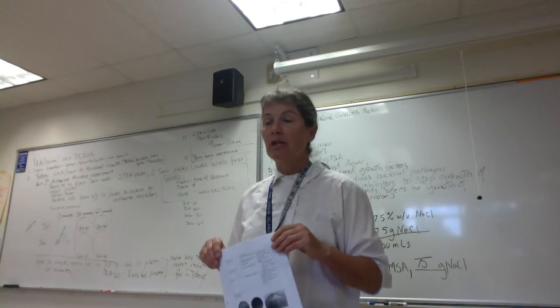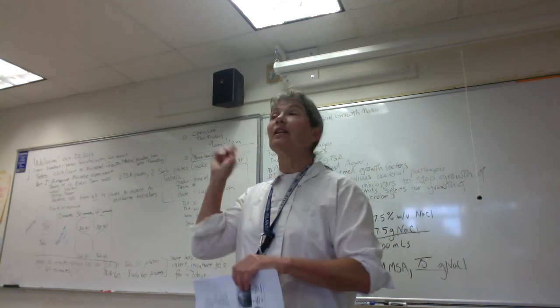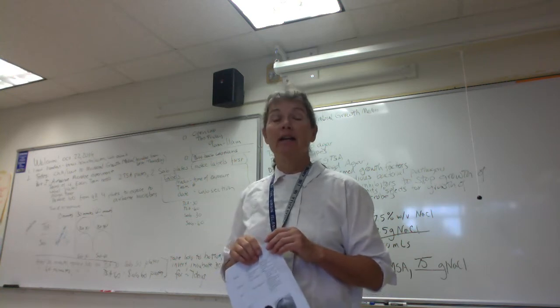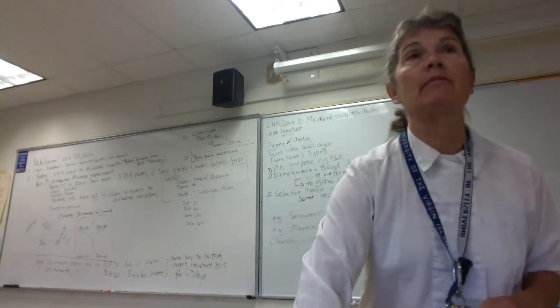So folks, do you think through natural selection, microbes that have evolved to live on skin, do you think they could grow at pretty high salt concentrations? Yeah, they can. And there's a really important bacterial pathogen, you guys, that does live on our skin, and that's the pathogen Staphylococcus aureus.